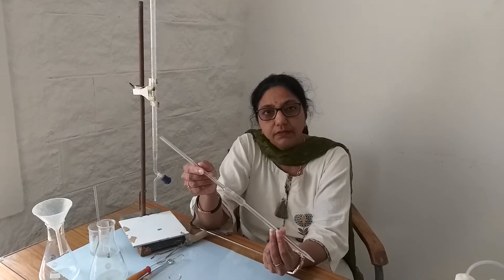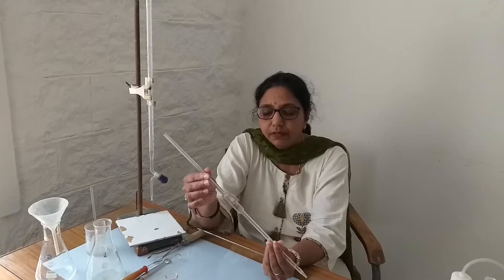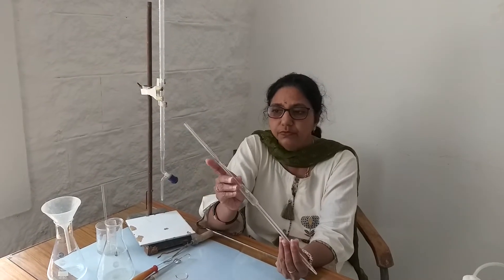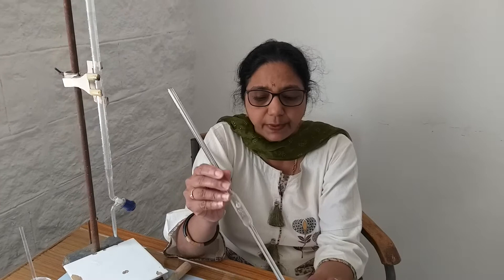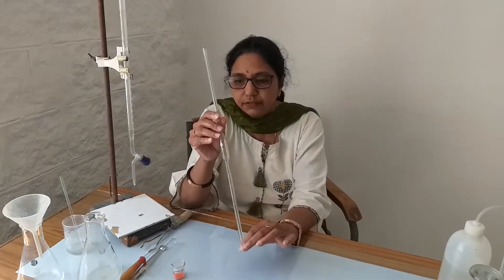This is a bulk pipette or a belly pipette. We can also use a graduated pipette in which graduations are there. The graduated pipette is narrow without a bulk, and there are graduations on it. But here, in the belly pipette, there is only one single mark above the belly. When the solution is drawn into the pipette, the solution should reach this mark. The lower part is tapering and the solution is taken out from below.